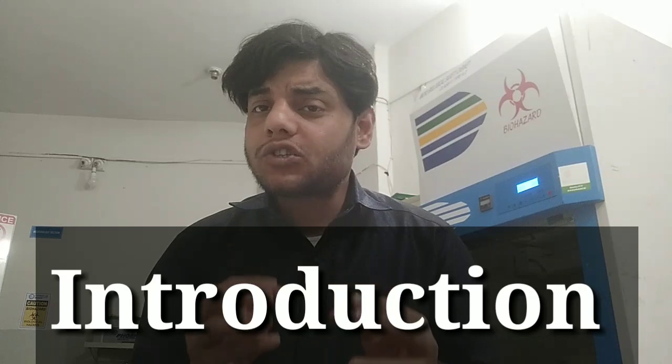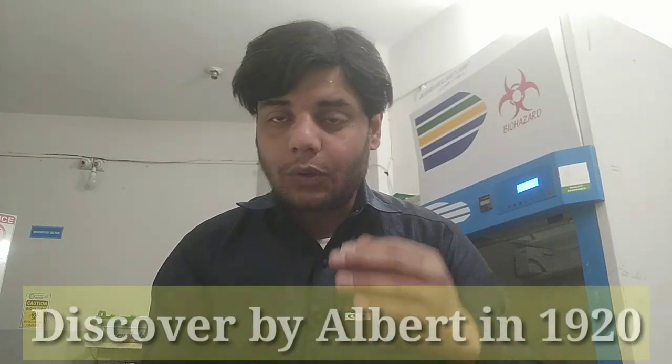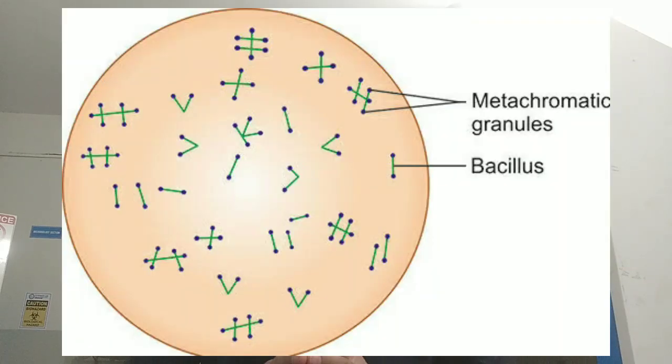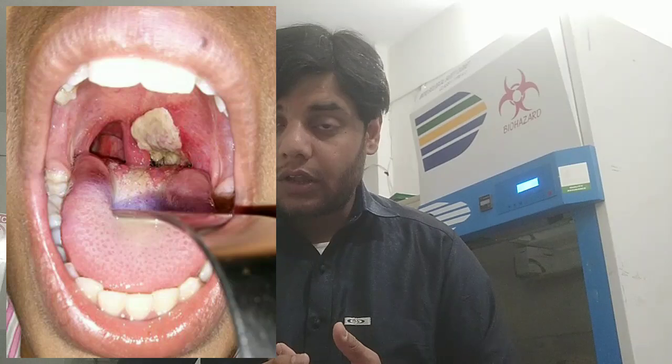Okay, so dear viewers, first of all, let's see what Albert stain actually is. Let me explain the introduction. It is a staining technique which was discovered by a scientist named Albert in 1920. This type of staining technique is especially used to find out the Corynebacterium that can cause diphtheria. Diphtheria is an upper respiratory tract infection, or we can say an infection of the nasopharyngeal area, which can be the nasal area and the throat area.